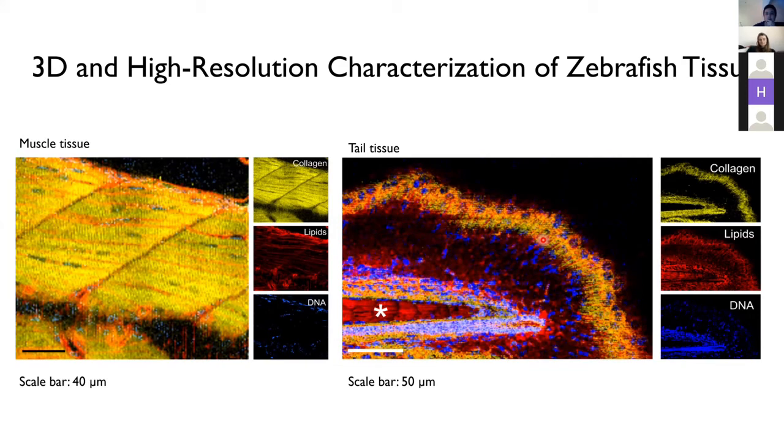And this enabled us to move forward. And we were next interested in using this confocal Raman spectroscopic imaging to address biological questions. And as James mentioned, I'm particularly interested in disease modeling in zebrafish, and I had previous experience working with infection models.